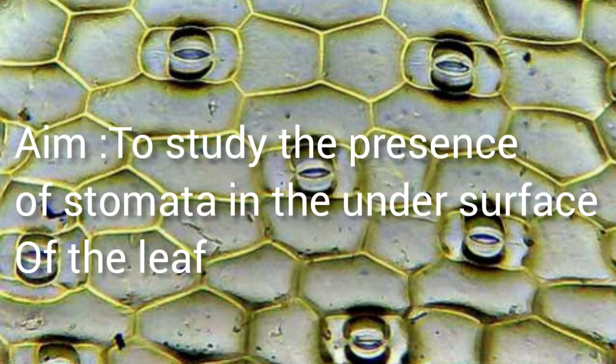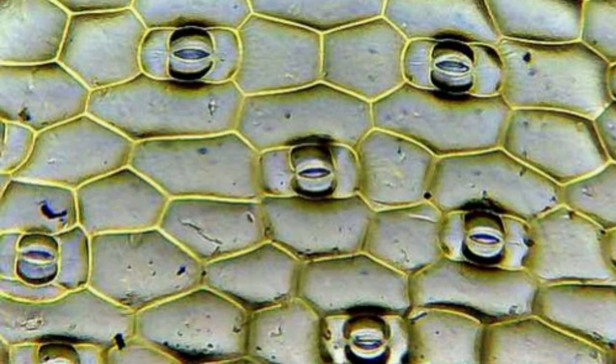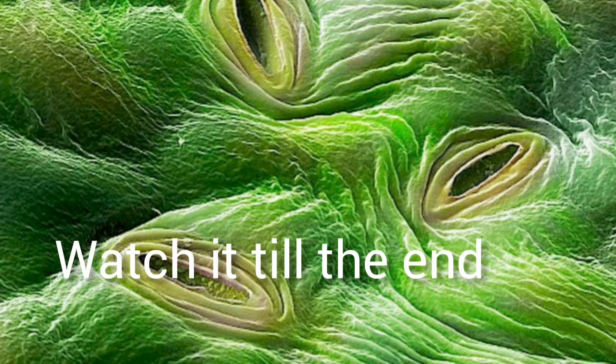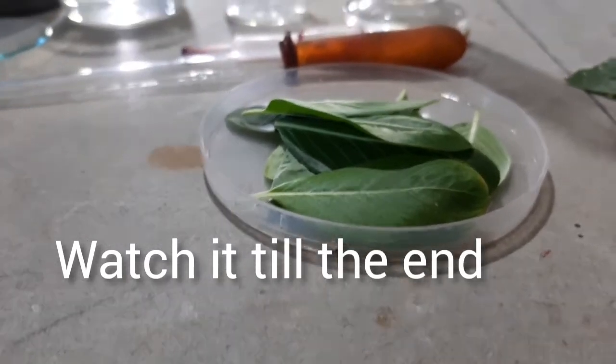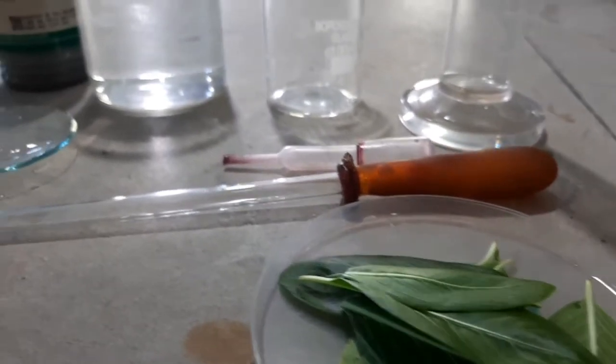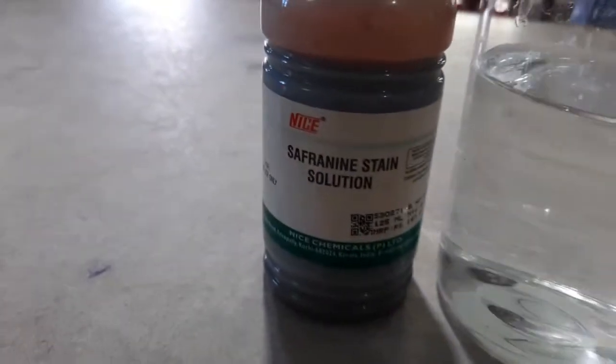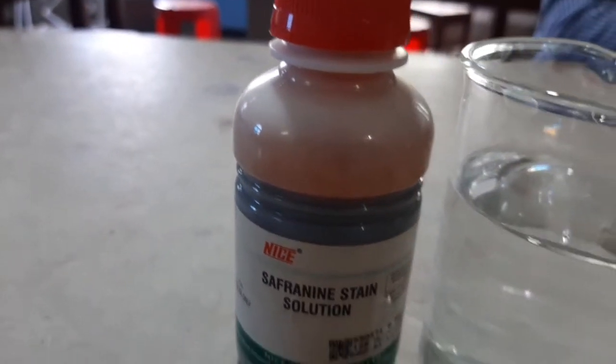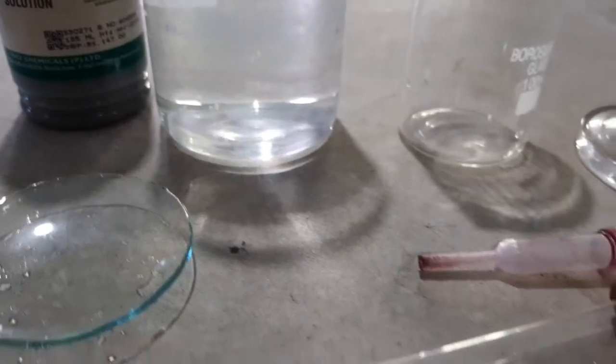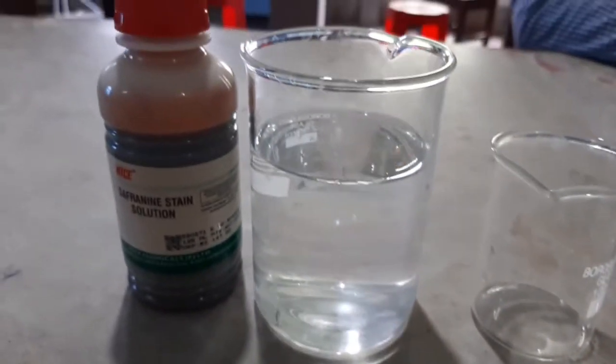So watch the video till the end and try to understand how to perform this activity. My dear students, you can see I have taken some periwinkle leaves. Here is safranine stain that you have to use for this practical. I have taken a watch glass, a dropper, and distilled water is here.